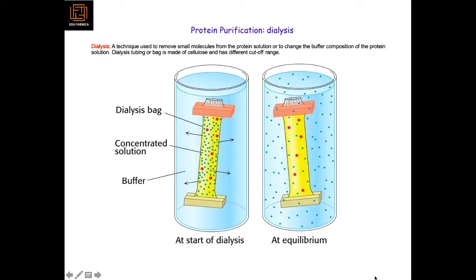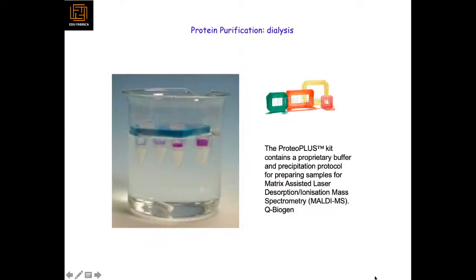At the start of dialysis, the figure will be like the left hand side. Then at equilibrium, all the small particles will come into the water and the bigger particles, the red ones, will remain inside the bag. So let's see how we do this technique.